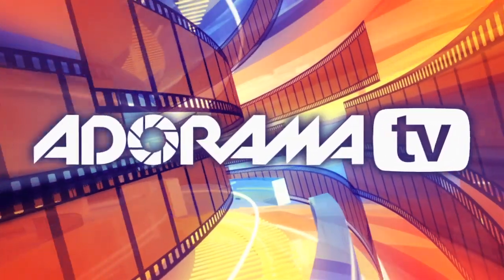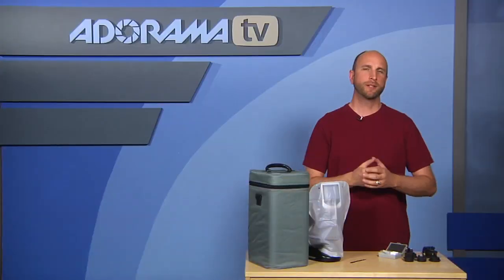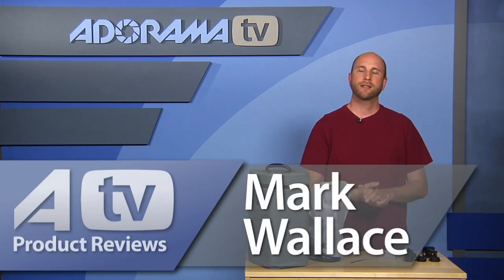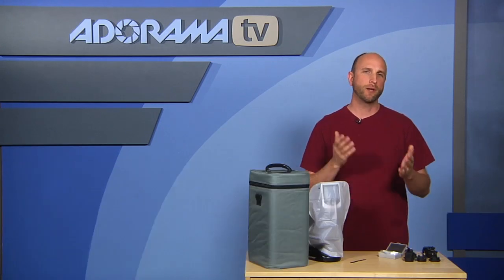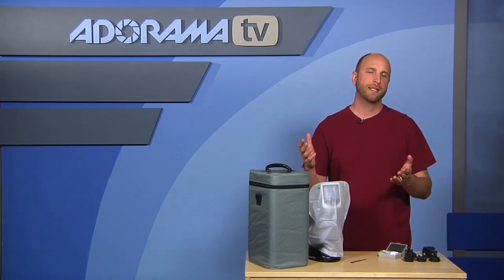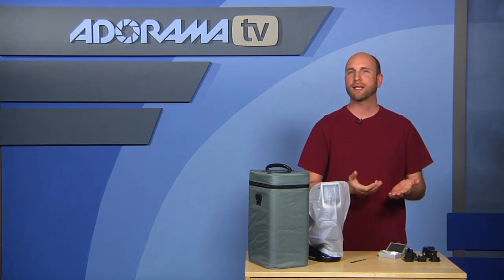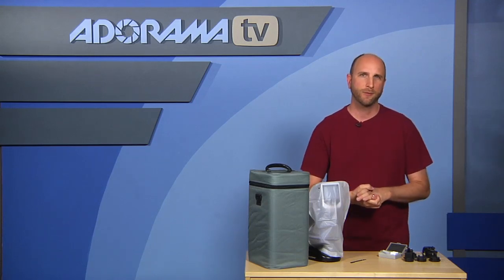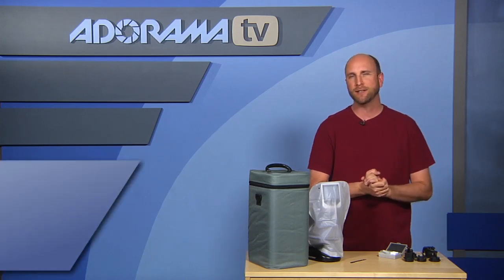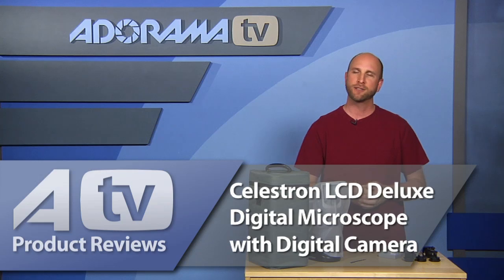You're watching AdoramaTV. Hi everybody, welcome to this week's episode of AdoramaTV product reviews. As a kid, two of my favorite toys were a chemistry set and a microscope, but my microscope wasn't anywhere near as fancy as the microscope I'm going to show you today. You're probably asking, what the heck does a microscope have to do with photography? Well, this is no ordinary microscope — this is the Celestron LCD Deluxe digital microscope with a built-in digital camera.